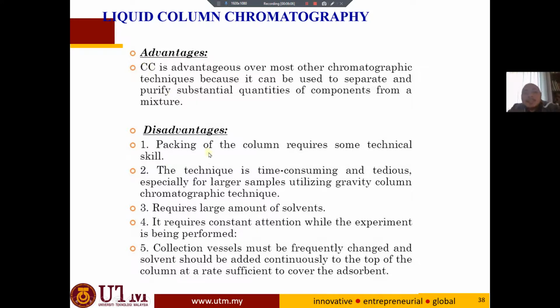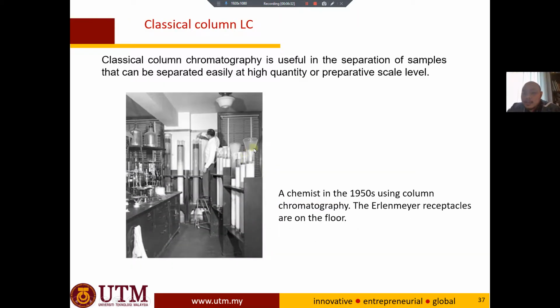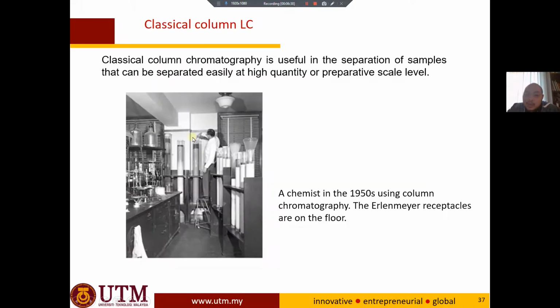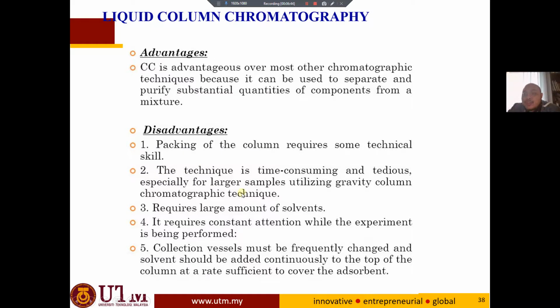The disadvantage: packing of the column requires some technical skill. If you don't pack it very well, like I said before, the packing material is not well packed, so it will move and disturb the process of separation. The technique is time consuming, because it takes a lot of time to prepare the column, especially when you deal with a larger column like this person's, and it requires a large amount of solvent. If you look over here, I believe you use liters, gallons of solvent. If you use a harmful solvent, of course it will be harmful to you.